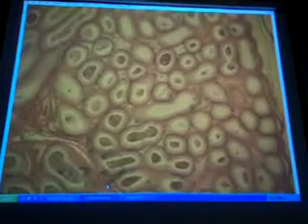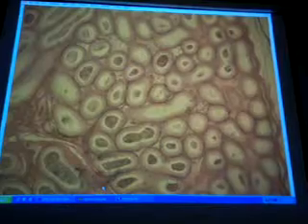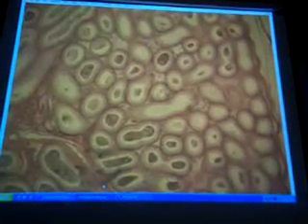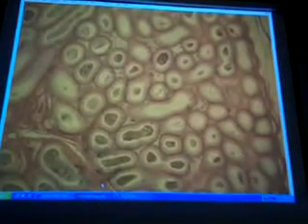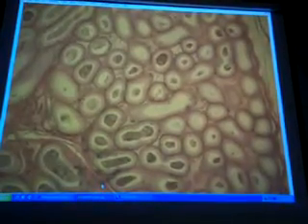Okay. So let's take a closer look. This is 40X. So a question I would ask in this magnification, identify epididymis. Don't put seminiferous tubule. I know some of you will. It's inevitable. It happens every year. Can't get that one over on you.